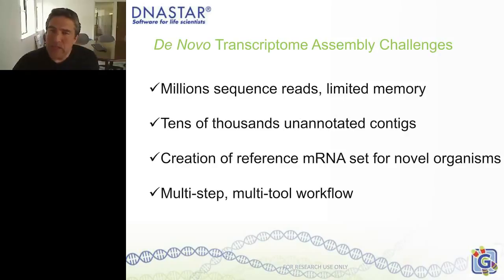Some of the challenges with de novo transcriptome assemblies, if you've done these at all, you know that with Illumina data in particular, if you have HiSeq Illumina, you're getting millions of reads. And oftentimes it's hundreds of millions of sequence reads. And most of the de novo algorithms that are available are memory limited.